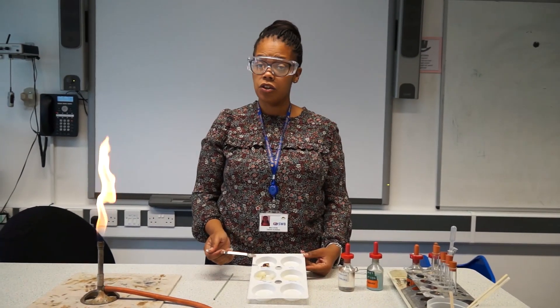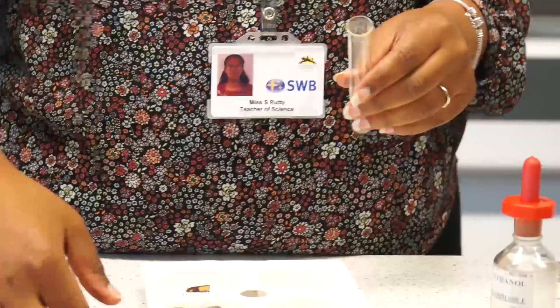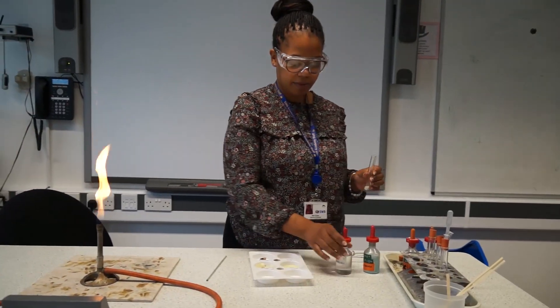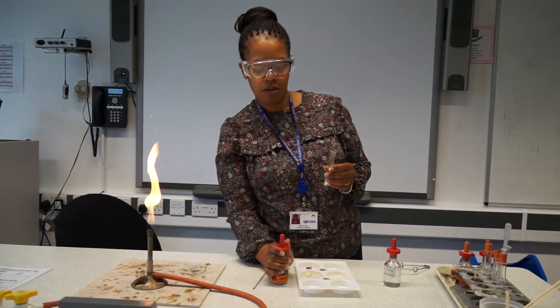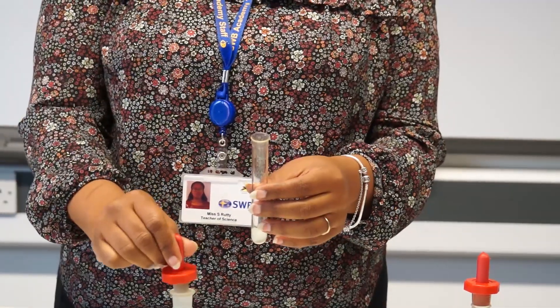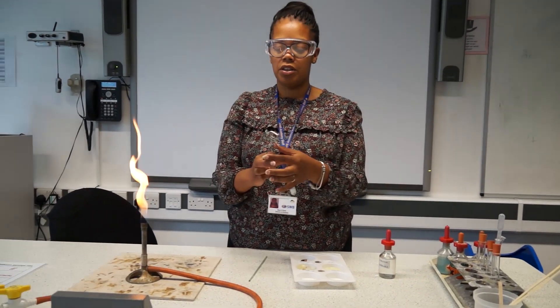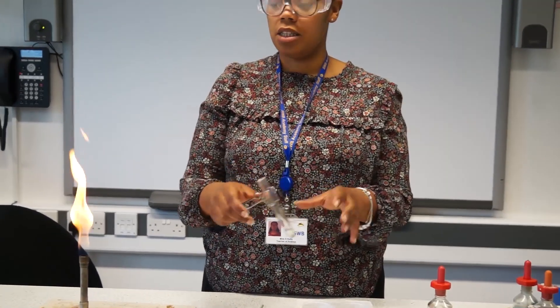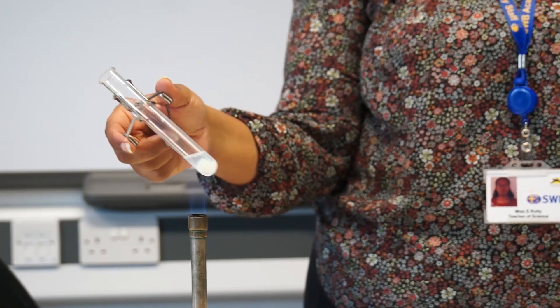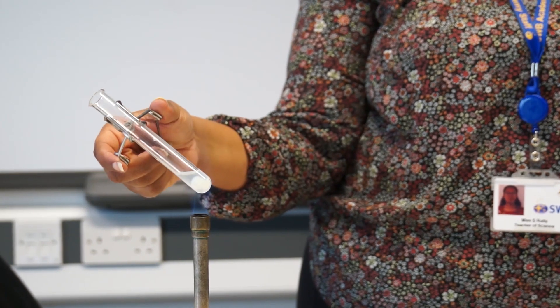Our third test is testing for the presence of protein. We're going to use egg for that test. I'm going to take another test tube, take some egg, place it in the test tube right to the bottom. We're going to use a solution called Biuret's solution and add that to the test tube as well. We are looking for a colour change. A positive test for protein is that the Biuret's solution will change to a purple colour in the presence of protein.